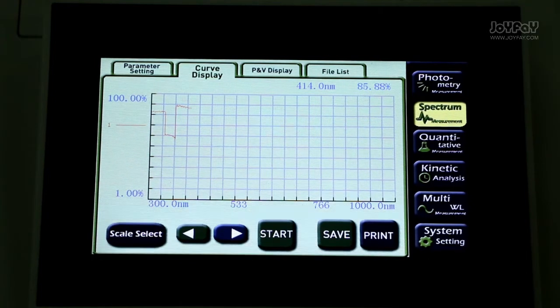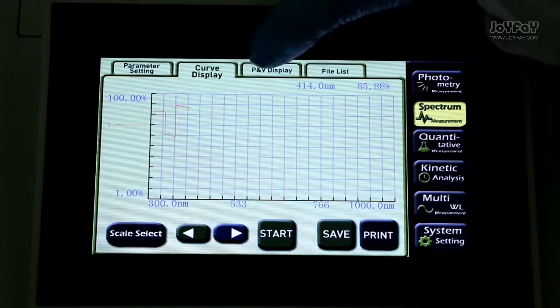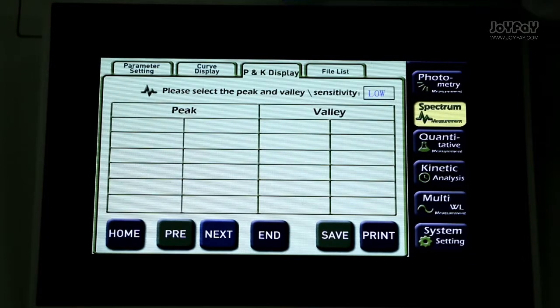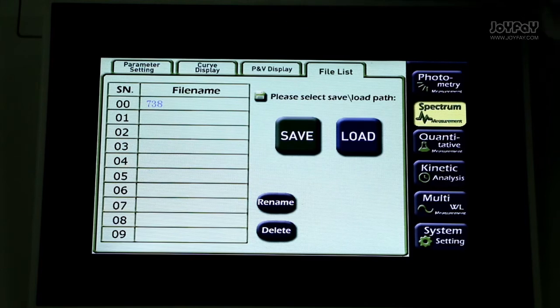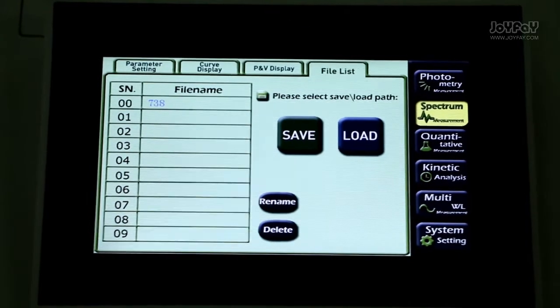And the final result can be seen in P and V display. All the results will be recorded in file list. Press print to print the result.